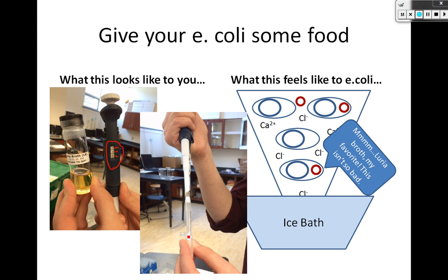And that again is both tubes, so the E. coli with the plasmid and the E. coli without the plasmid. And the directions are really clear as to when to change tips. You don't always want to use the same tip because you don't want to contaminate your tubes. I'm talking about on the micropipettes.